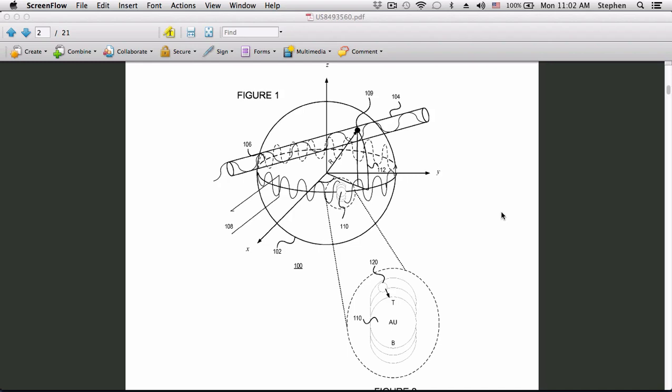If that nanoparticle is a single protein molecule, then the shift is incredibly small, well below the noise in at least our experiments. So if you want to see this sort of thing in real time, it turns out a plasmonic particle on the surface reveals the protein and enables you to measure properties of it.